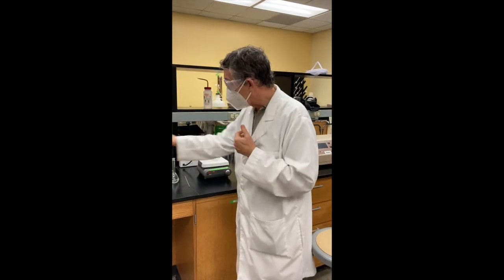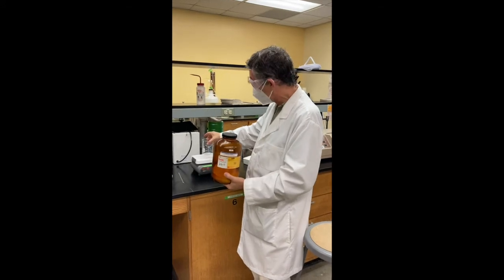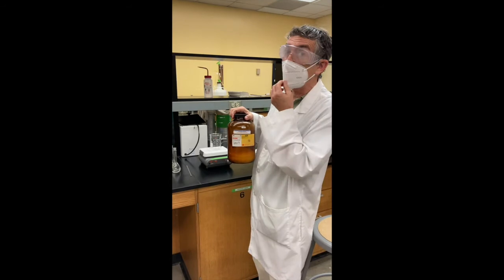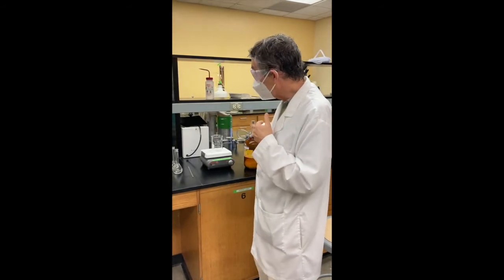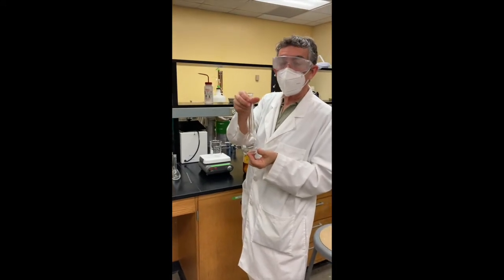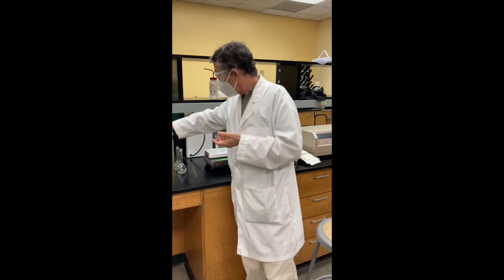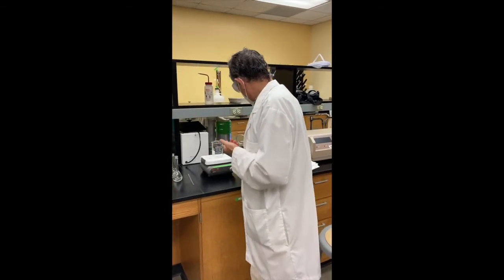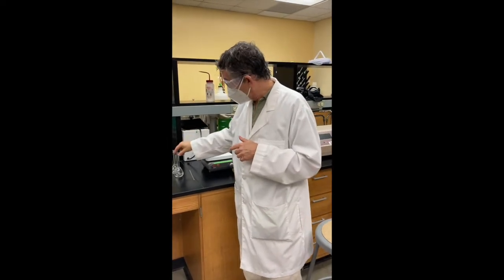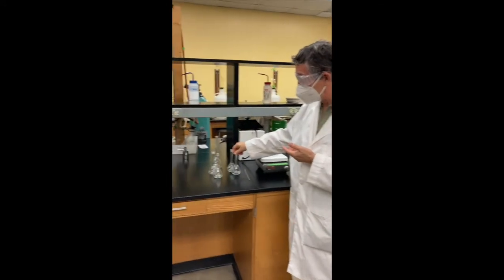So that's basically it. You'll use a hot plate, add a certain amount of this polyvinyl alcohol, heat it up until it all dissolves, and that will take a long time. It often takes an hour. Then you'll have to dilute it. So you'll first make a solution in this 250 ml volumetric flask. You'll take some of that out to cleave with the potassium periodate, and then each of those solutions you'll dilute into these 100 ml flasks. And those will be the 4 samples you want to analyze.